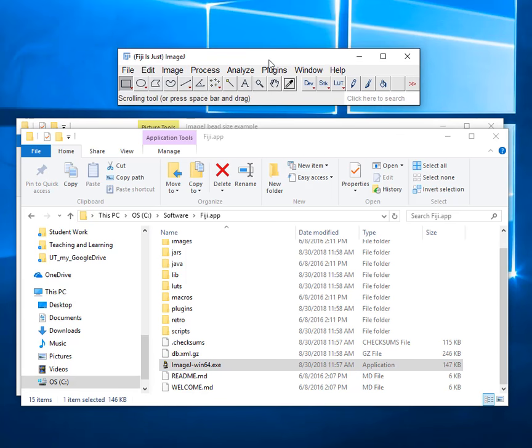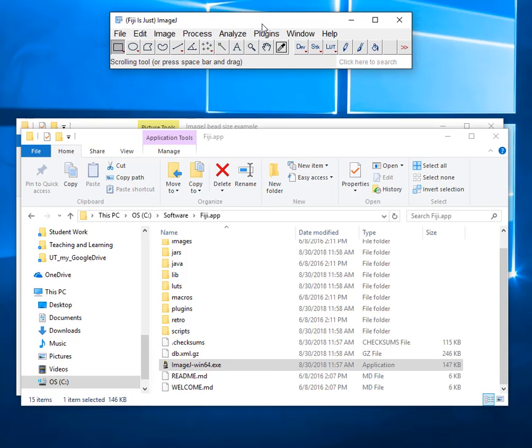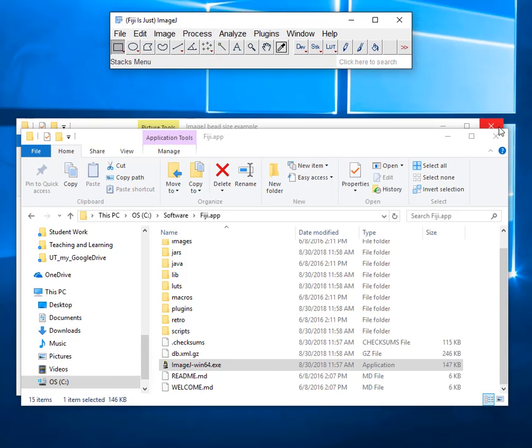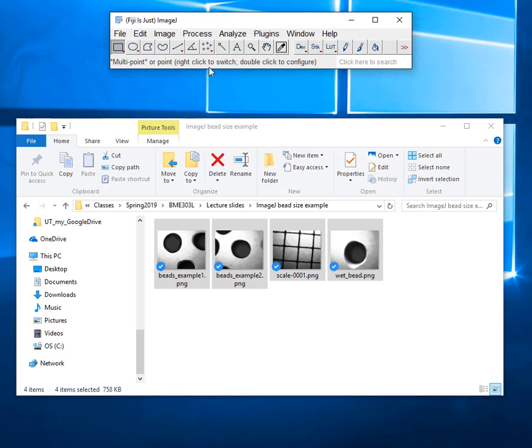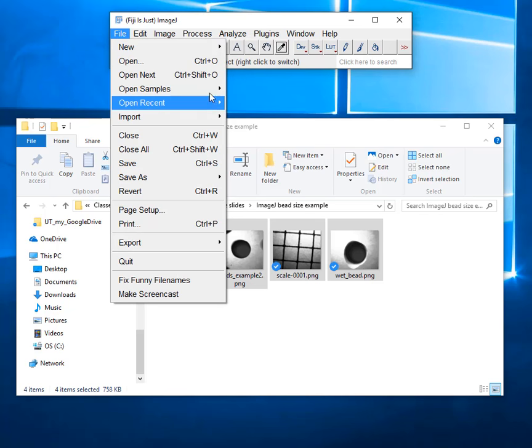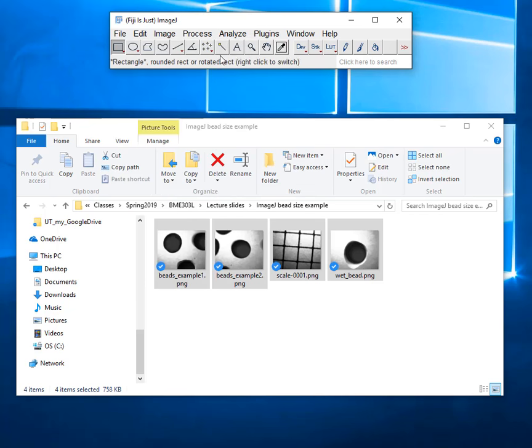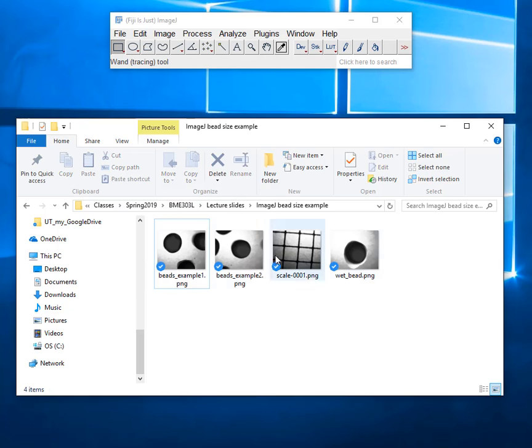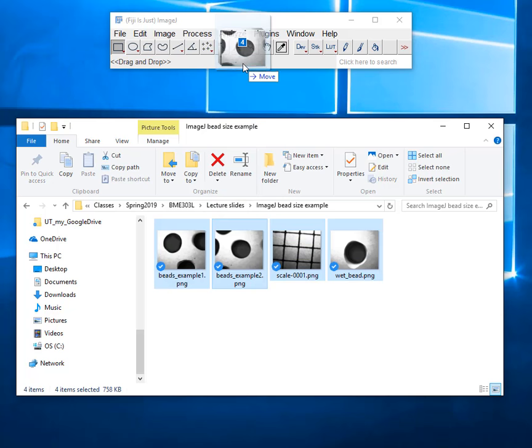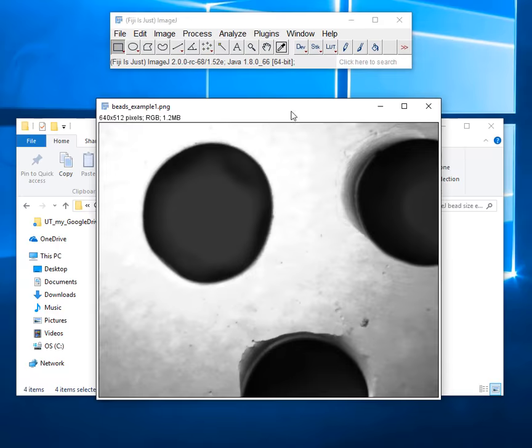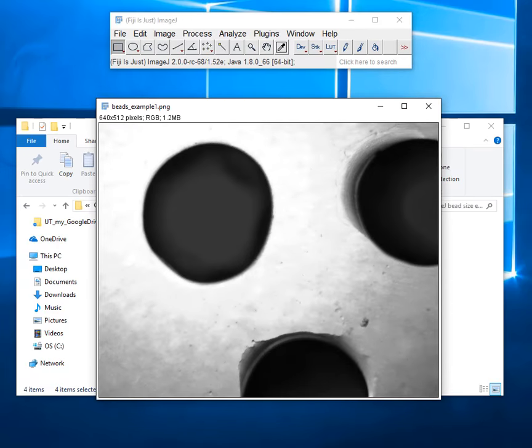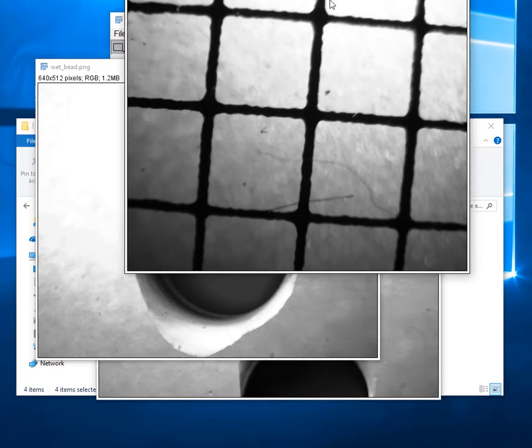So we run ImageJ. Sometimes it'll ask you if you want to update, sometimes it won't. But this is all it is. If you want to open files you can either go to file open menu or you can just, I got my bead pictures here and my microscope slide picture there. I can just select all those and drag them into the bottom bar there where it says drag and drop now, and it opens all the files for me.